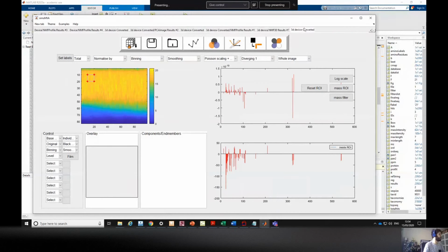Okay, so before I finish, last week I was doing the spectra, and because the carboxylic acids were too different from each other, we couldn't see really well how to see the groups and things like this. So we just used this built-in example here in simsMVA, one of the spectra. So we got example spectra. There's one for wood. We use this one to show very quickly some of the things I wanted to show last time. But because I've just finished this 3D, I'll wait 10 seconds, just to see if there's any question.